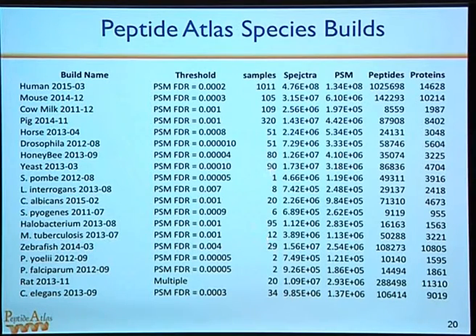This is the number of samples, so the human is clearly the biggest right now. And we definitely have more samples than this, but as time goes on, some of the smaller ones aren't really worth our while to bring them along. They're lower mass accuracy, things like that.